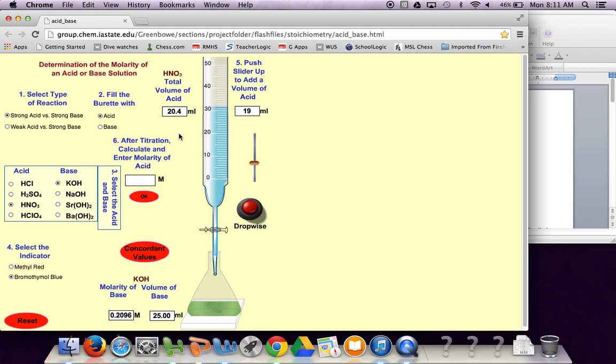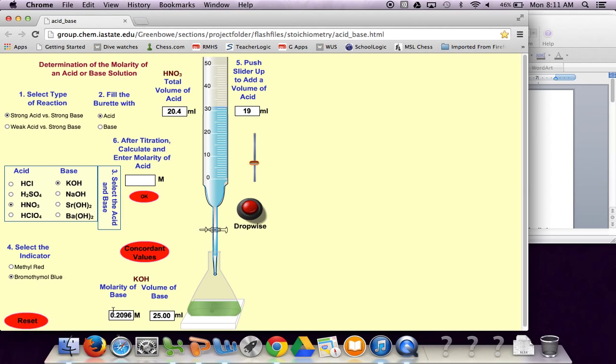We're at 20.4 milliliters of our acid that we used and these numbers would be really important. So actually the way this animation is doing it we know the molarity which is our concentration and how much base we started with.